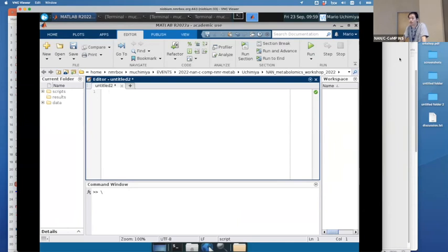That's a permanent record. That's the best record that you'll ever have to know what you actually did and to tell others in the community about it. So I recommend that when you get something that works, you see a nice plot, you're happy with it, that's it. That's frozen. That gets deposited with your data. So that's why we refer to this. Thank you.